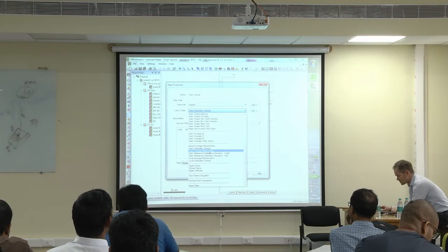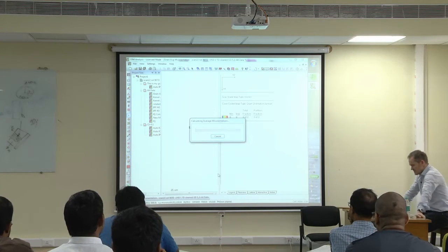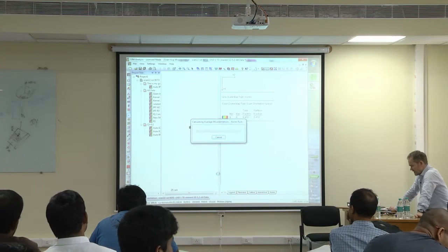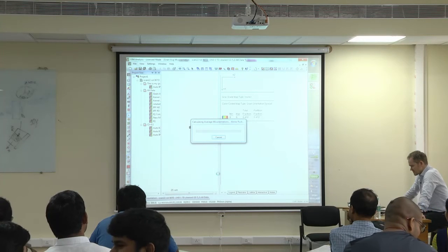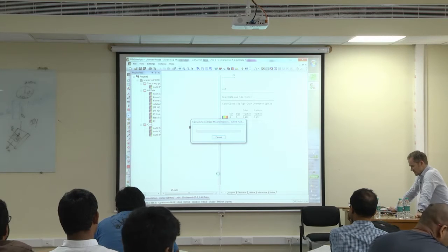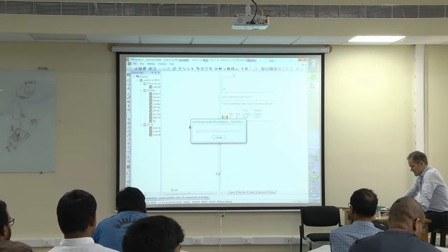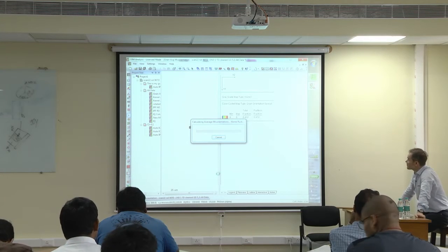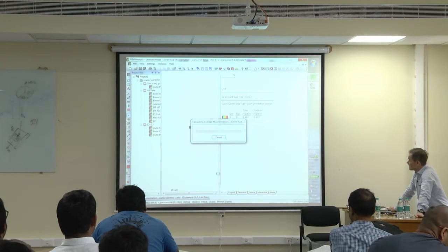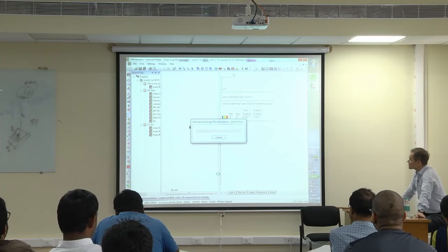Let's try grain average misorientation. What does this do? Calculate that one. Okay. This takes a longer while, yeah, as you see. But I believe it will calculate eventually. Otherwise, we have to try it with version 6. I would guess this is a bug inside of that software. I have given these presentations maybe earlier with version 6 and not with version 7.